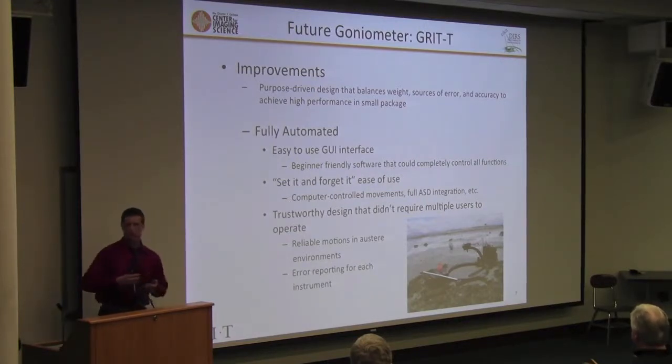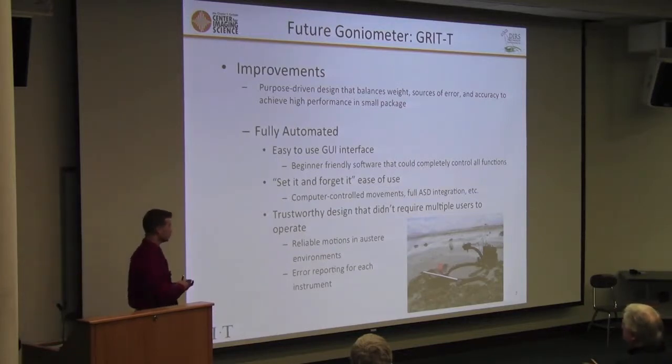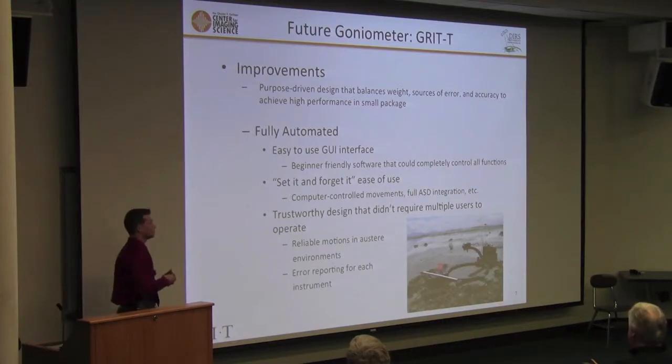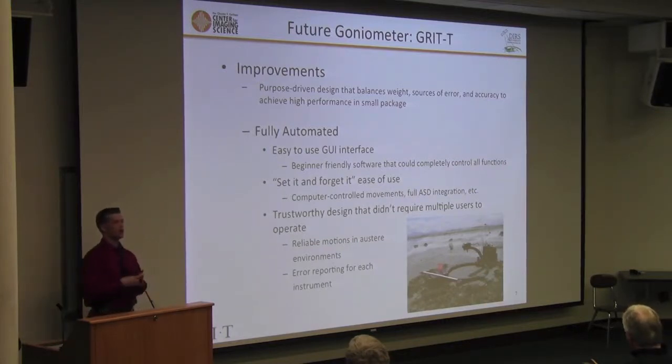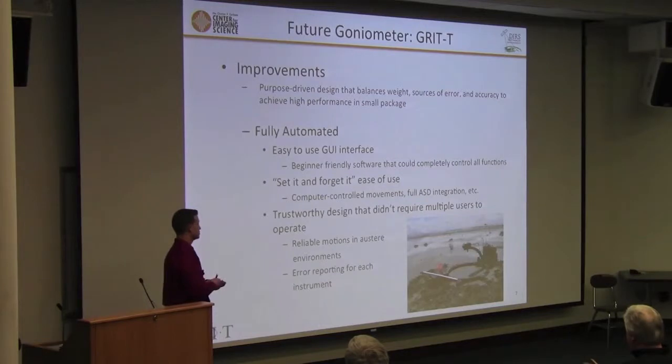You program your scan pattern in. The scan pattern is then executed automatically via computer-controlled motions that are constantly monitoring for errors and other things, and controlling the ASDs, all in conjunction. In order to do that, you had to have a trustworthy design, because we didn't want multiple operators to have to sit there and monitor it and ensure that it's reaching where it's supposed to be going. So we required reliable motions in austere environments.